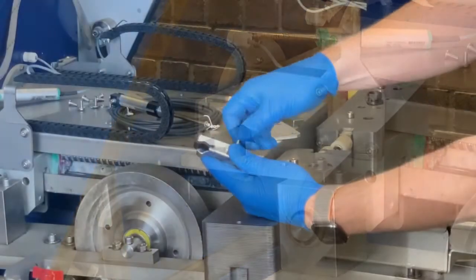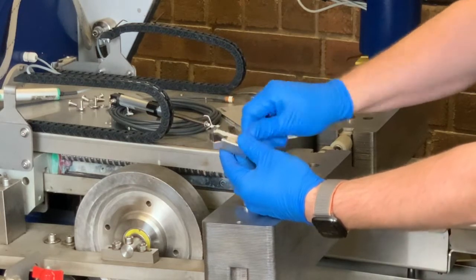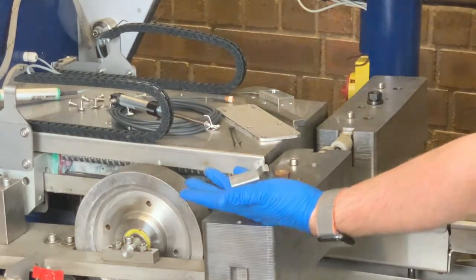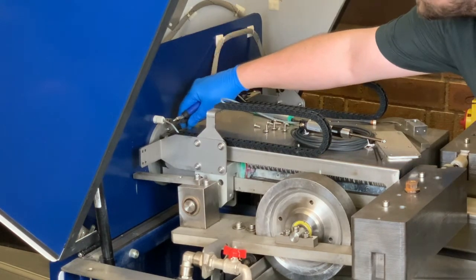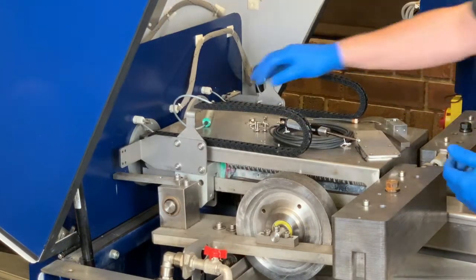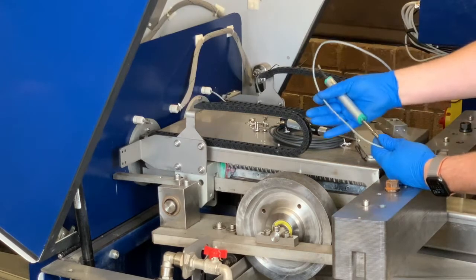Again, remove the set screw and set it aside — this piece is no longer needed. Next, we're going to remove the LVDT. We're going to snip the old wire, then remove the old LVDT by pulling the wire through the track. This can now be discarded.